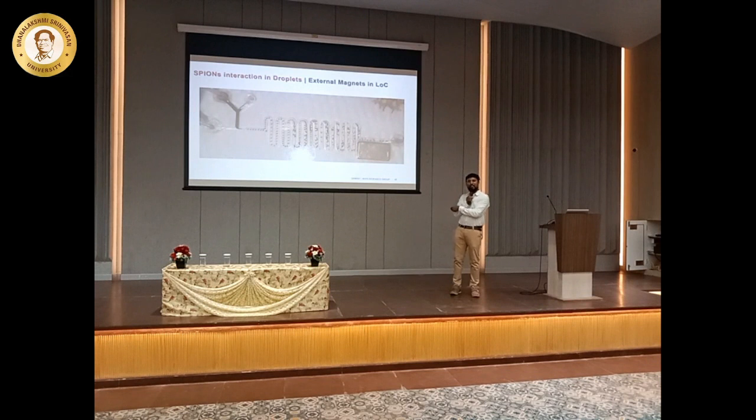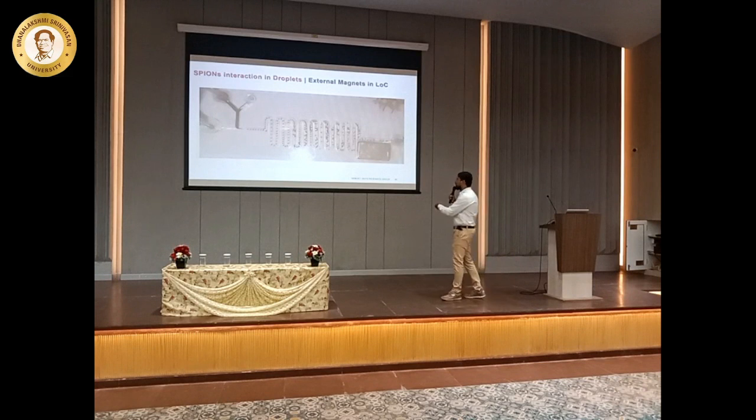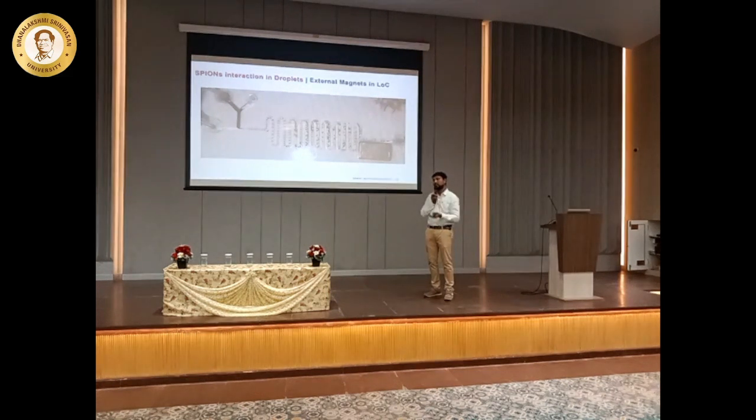These are all the preliminary experiments that we are working on. These are all unpublished data, but still I'm showing it. We have nanoparticles that can be attracted through a small magnet that is present here, and then we can capture whatever CTCs or exosomes that we want. It's all the magnetic interaction which is going to happen within the channels. It's going to be interesting, and for a better diagnosis, this will be really helpful.